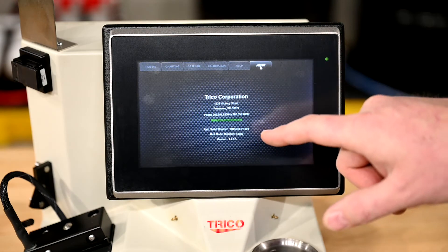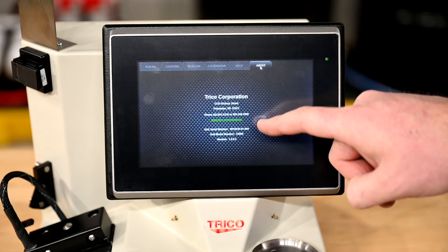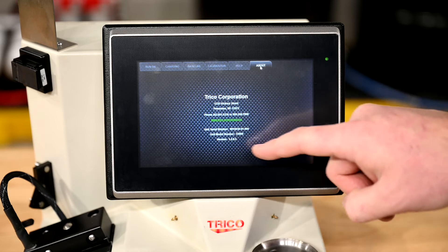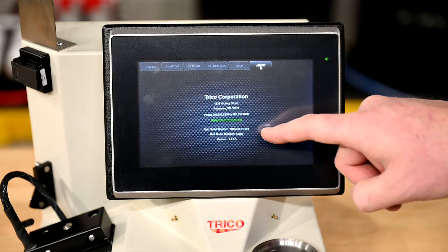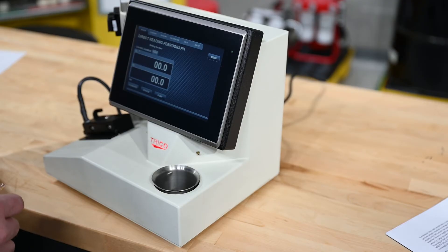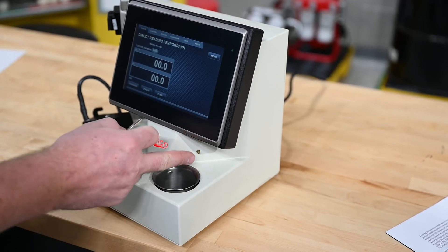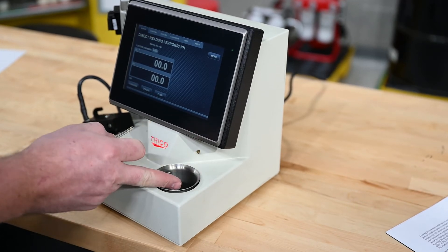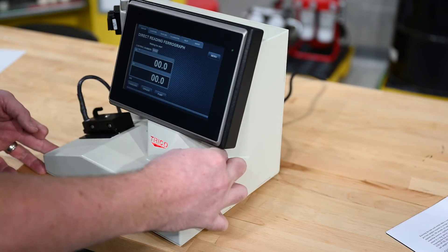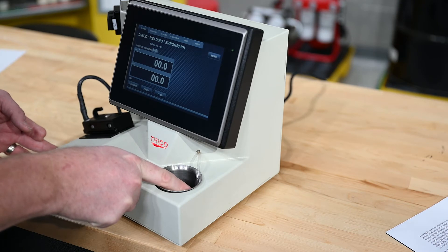The about tab gives Trico contact information for any issues, the unit serial number, the unit model, and the version of software you are currently running — this information is needed for any troubleshooting. Now before you start running any samples, you need a waste hose that connects the right bulkhead into the waste deposit. All you do is attach the hose to the hose barb and make sure the hose runs into the waste beaker.